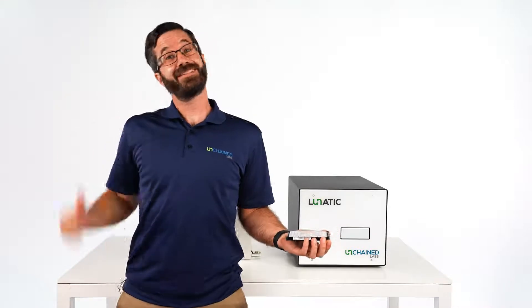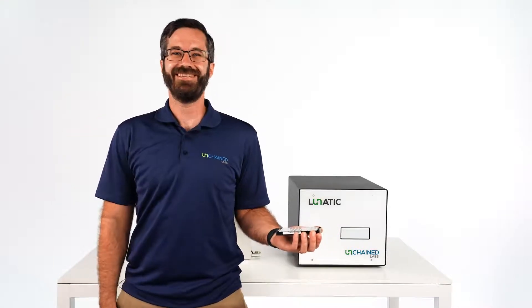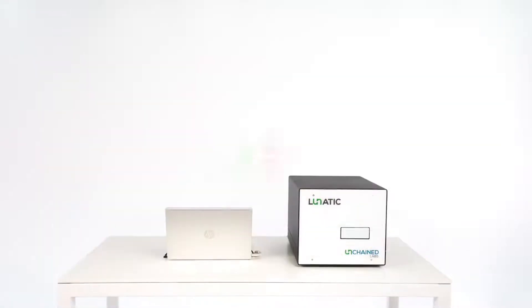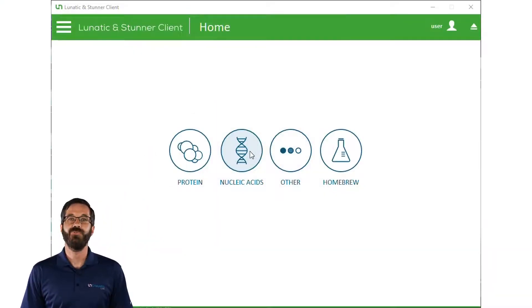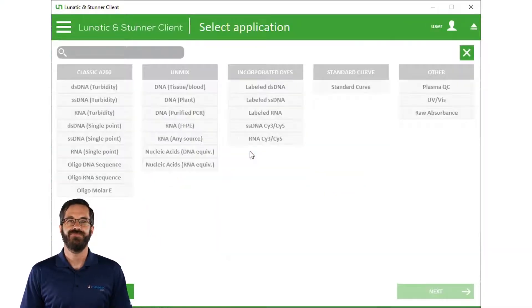Now that the plate is all loaded, let's step in Lunatic's software so you can see how easy it is to set up an experiment. From Lunatic's home screen, we pick the type of sample we're looking at. Then we pick the application we'll be using.